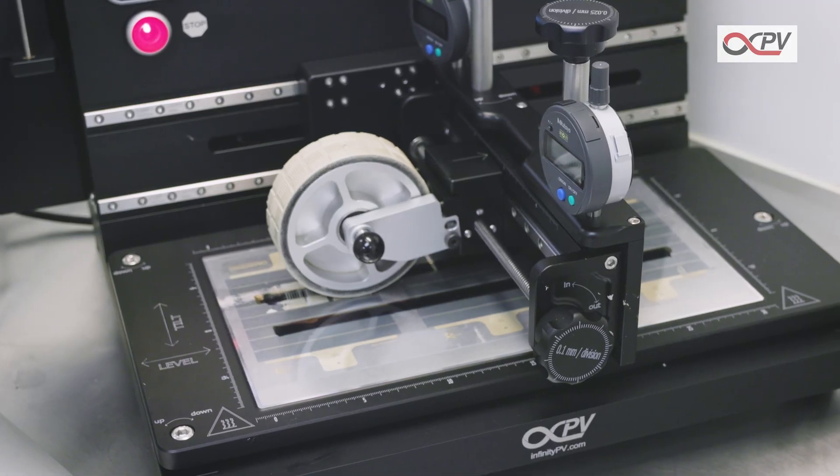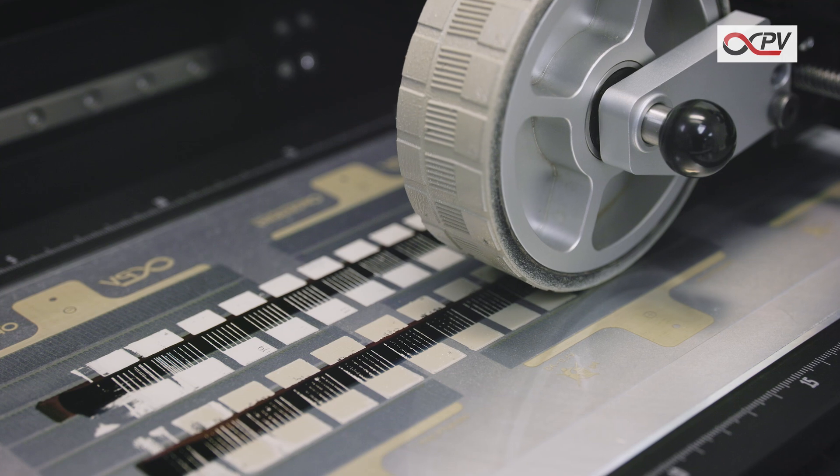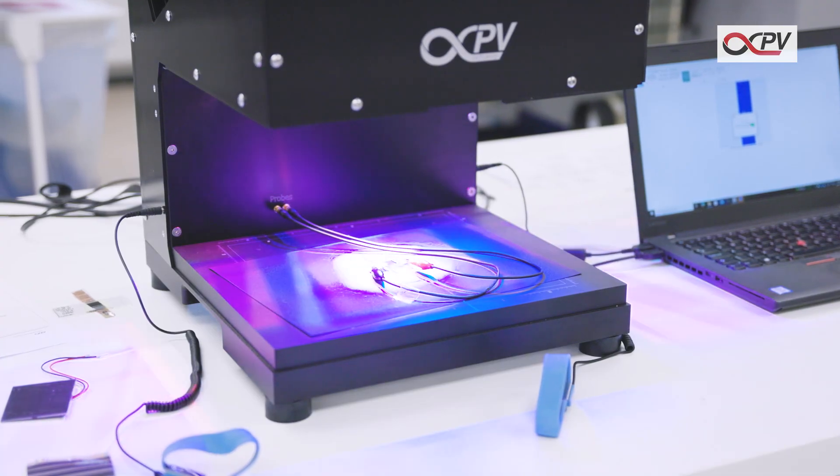Start the Flexo Roller. Once the Flexo Roller is done, repeat the process for the second stripe. The solar cell is now complete and can be cut out and characterized.